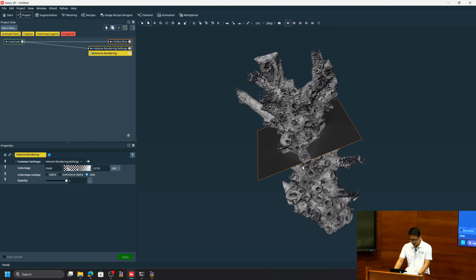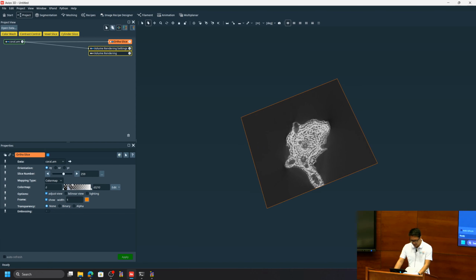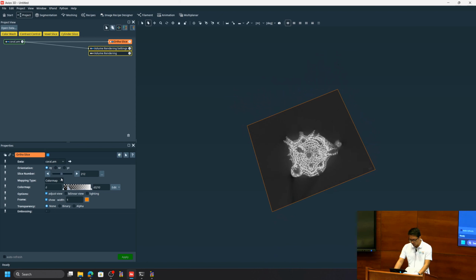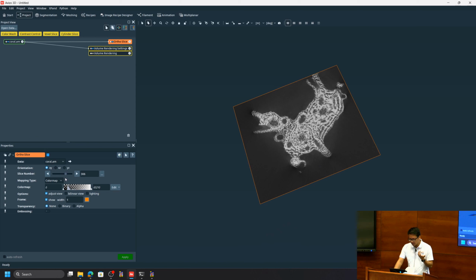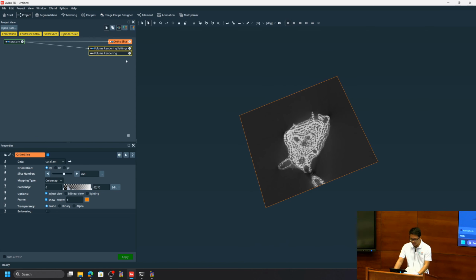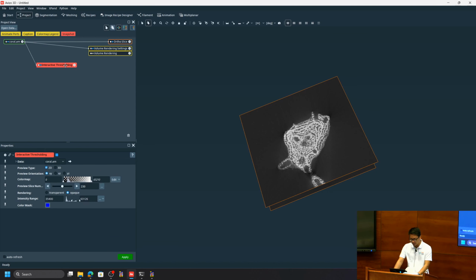And if you look at the slice, this allows you to see inside the data. You're going to notice there are pores inside, right? I'm not an expert here, but for now I'm just going to call those pores or less dense materials, and there's the dense region. And for today, I'm going to show you how to measure the dense material and the non-dense material and see the fraction or the percentage. So the first thing I'm going to do is use thresholding, right?